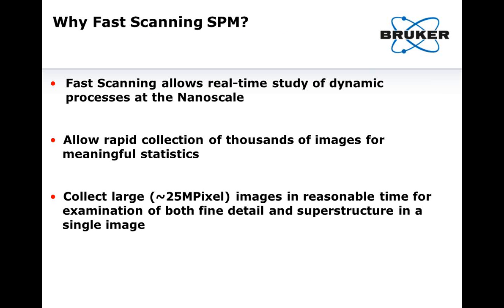So, why fast scanning AFM? Well, quite simply, we don't live in a static world. Most of the interesting phenomena occur as systems change from one state to another. Fast scanning permits us to interrogate these systems and use the AFM to observe these dynamic processes.